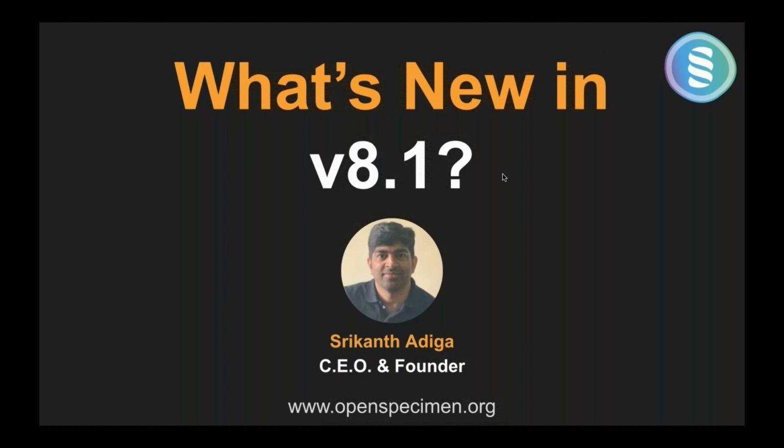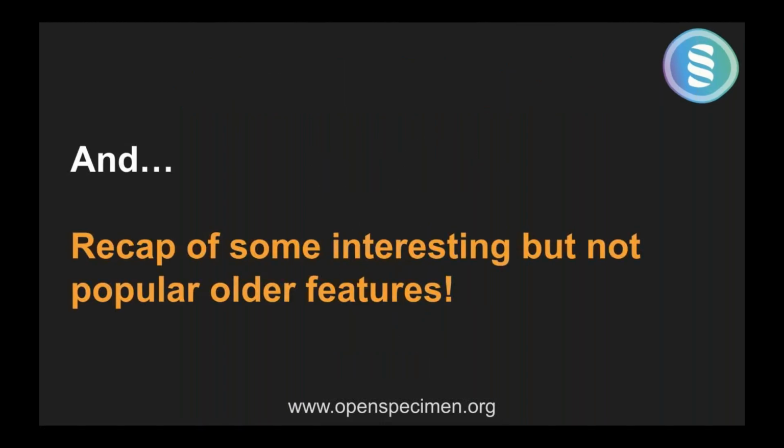And we also plan to cover some of the older features which are interesting and maybe useful, but not always visible or evident when we release new features, because there are so many things you might not see all of them. So at the end, we will recap some of the popular features, and some of the not so popular but interesting features.